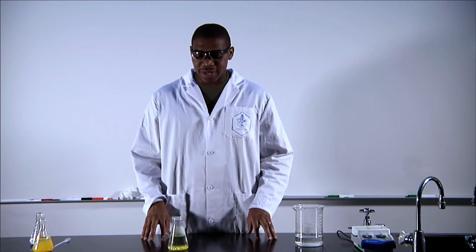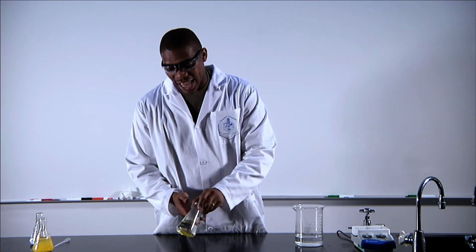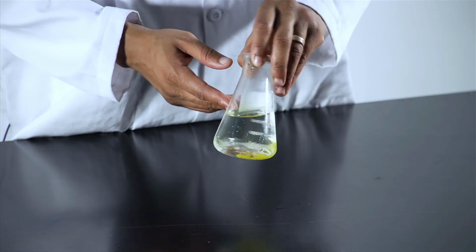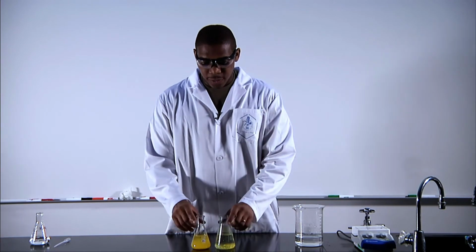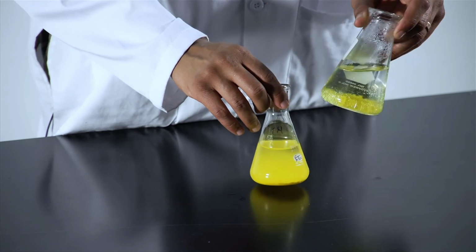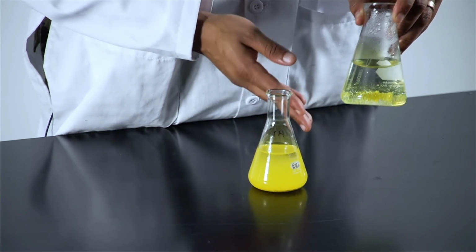All right, so now that we've let it settle out for a little bit and you see the time-lapse version of it, hopefully you can see the nice recrystallization happen, with the precipitate of the lead iodide settling out of the solution as we let the temperature cool down. So what you'll see here now is the recrystallization of the lead iodide now that the temperature of the solution has cooled down and the lead iodide has precipitated out.